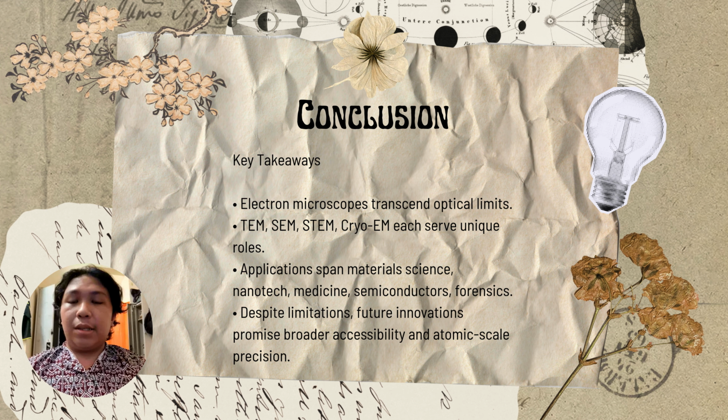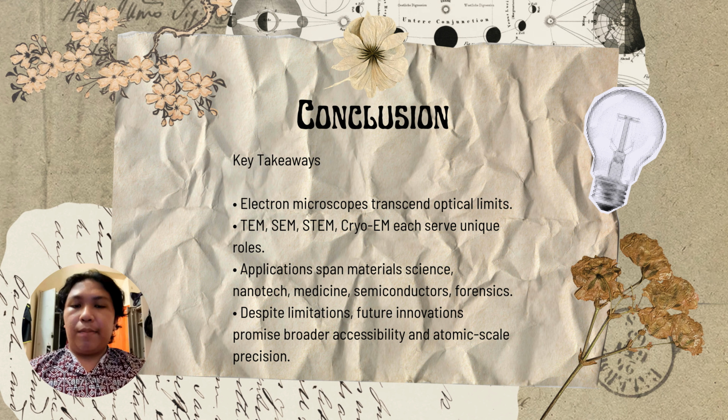Last but not least, we have the conclusions. For key takeaways, the electron microscope transcends optical limits. TEM, SEM, STEM, and cryo-EM each serve unique roles. Applications span material science, nanotech, medicine, semiconductor, and forensics. Despite limitations, future innovations promise broader accessibility and atomic scale precision.